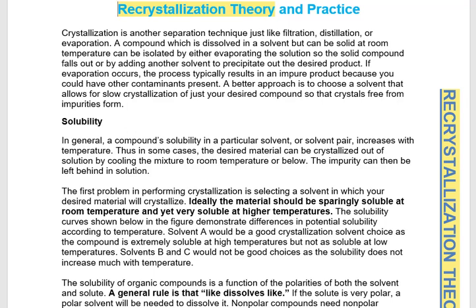With recrystallization, the guiding principle is a compound's solubility. You can look at that compound's solubility in one specific solvent, or a solvent pair, a mixed solvent. But you're also going to be looking in regards to temperature. So, solubility related to a specific solvent and temperature.